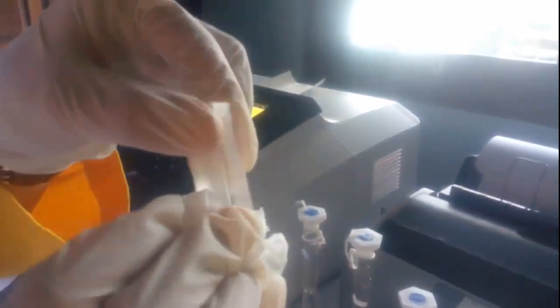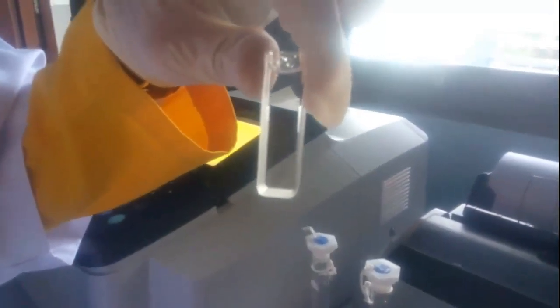Wipe the clear side of the cuvette with tissue. Then put the cuvette in the measure slot, where the samples are placed. The measure slot is in the front of the instrument.